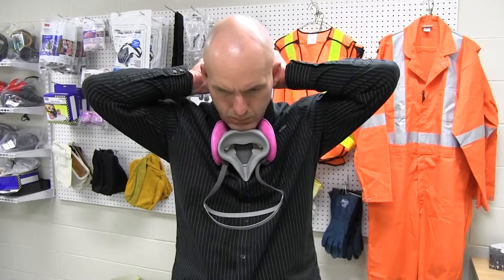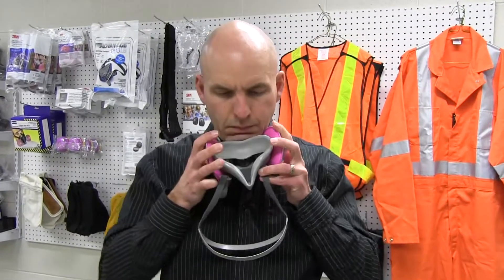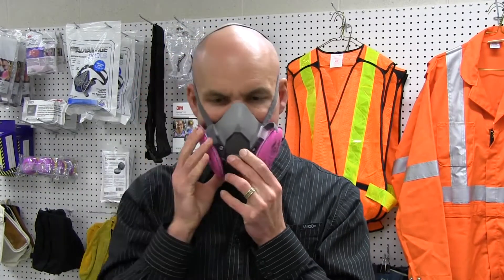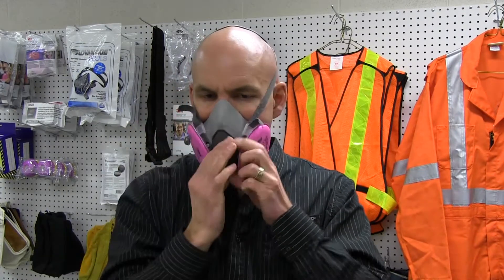A fit check must be conducted prior to each use, and before entering an area or conducting work that requires a respirator. The fit check determines whether or not the respirator is airtight and capable of preventing exposure to airborne contaminants when used with the proper filters, canisters, or cartridges.